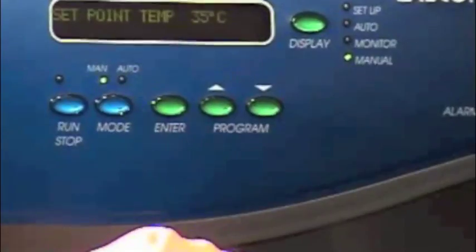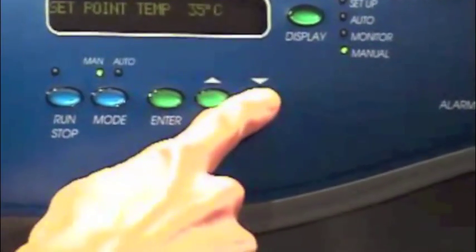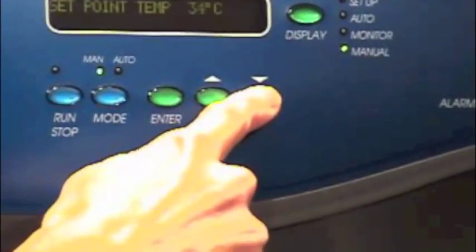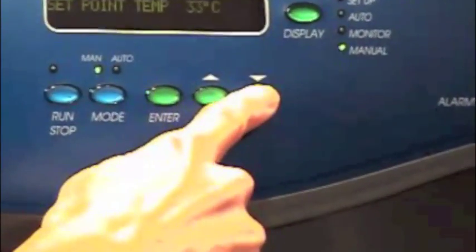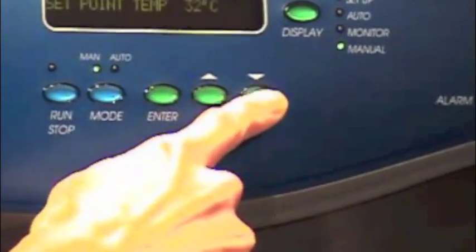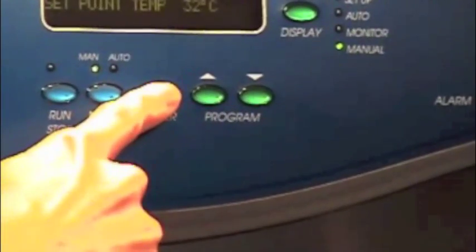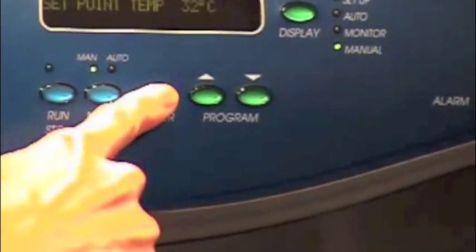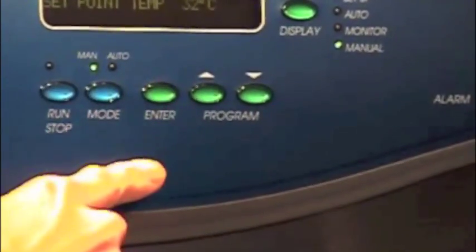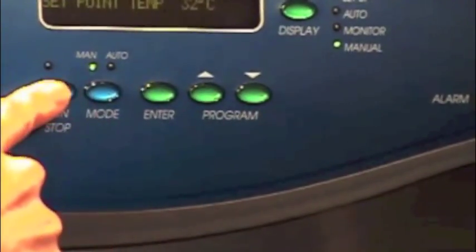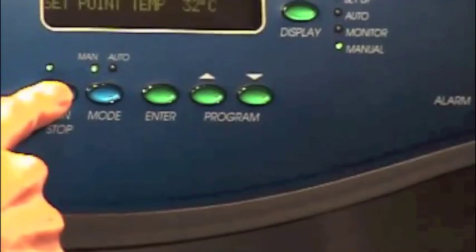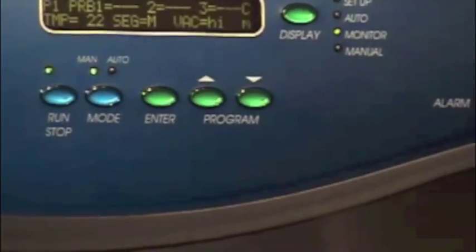Press the display button until the manual indicator is lit. Use the upper up and down arrow keys to set the appropriate shelf temperature. Hit the enter button within ten seconds to store set points. Hit run stop to start the process.